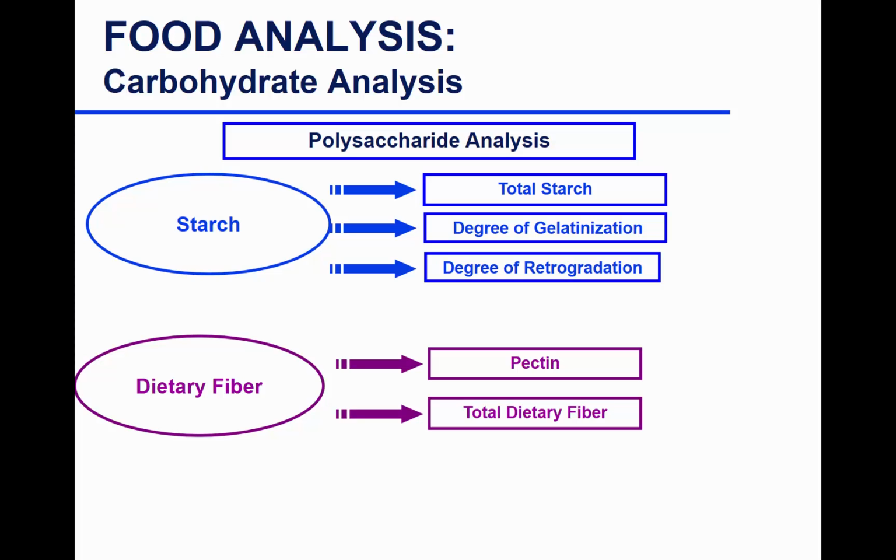Questions on mono and oligosaccharides? Yes, Sarah. Why would you choose one method over the other? Very good question. We talked about it briefly when we covered the chromatography chapter. You have so many different modes of separation. Why would you choose one over the other?